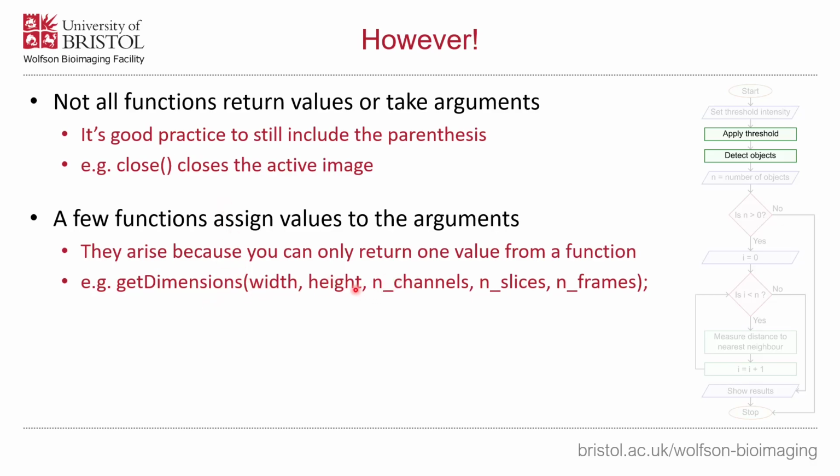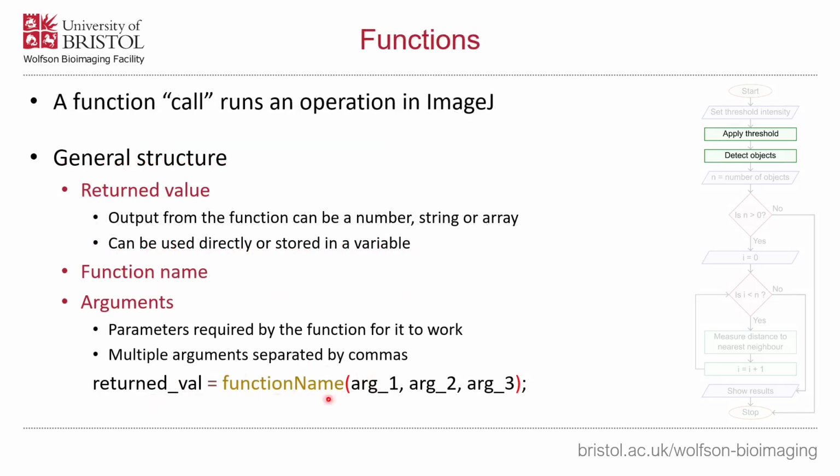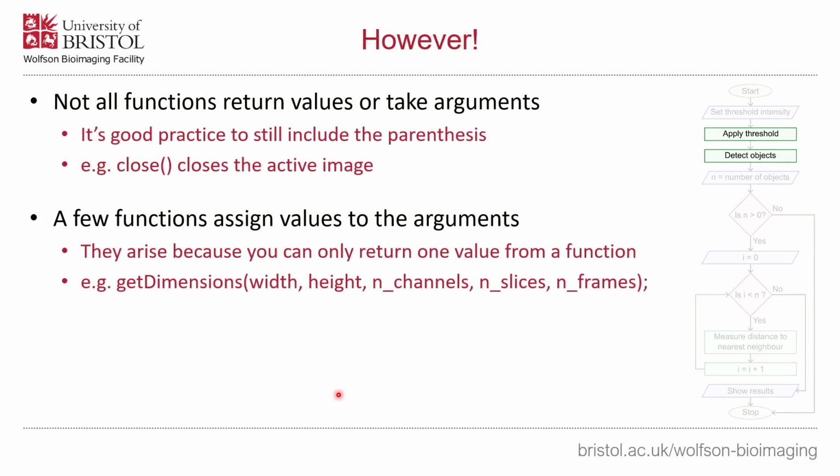I think this one, and possibly the equivalent for getting details from a stack or a hyperstack, work in the same way, but these are few and far between. Typically they're going to follow this function format here, and if in doubt you can refer back to the documentation online, that list of all the functions that are available.